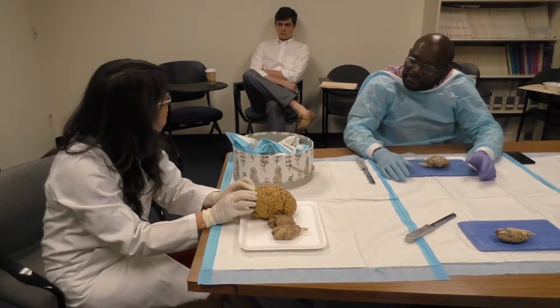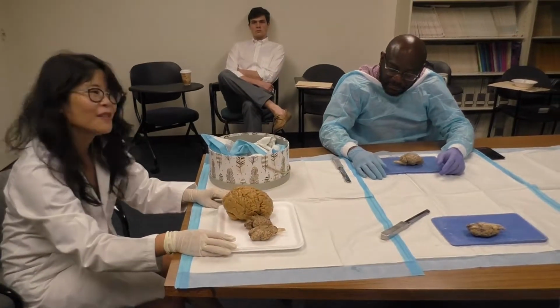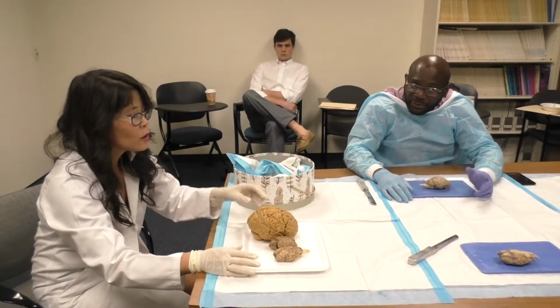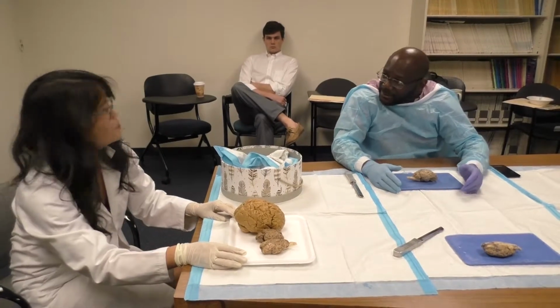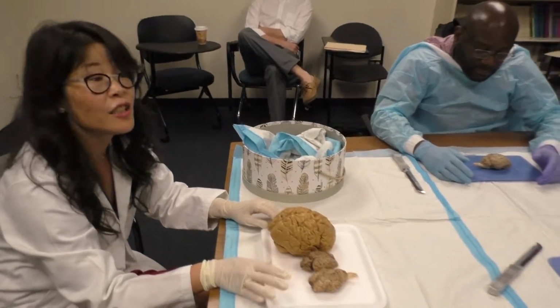Occipital lobe, we already talked about. Primary visual cortex. What about parietal lobe? What is that area involved in? Sensory perception, like how you are holding yourself and everything like that. Mm-hmm. So, proprioception. The body senses, basically. Right? So one of the newest and most exciting areas that have focused on the parietal lobe is decision making.